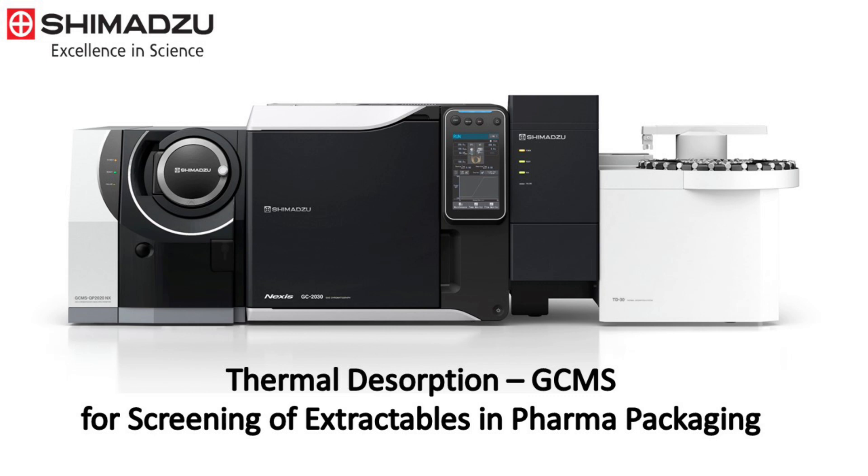Sample was simply cut into small pieces and placed inside the TD sample tube. The TD short transfer line minimizes dead volume and its sample line is fully heated with no cold spot, enabling high-sensitivity detection even for highly adsorbent components.